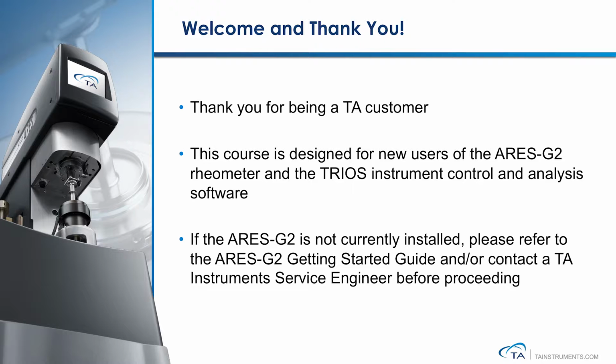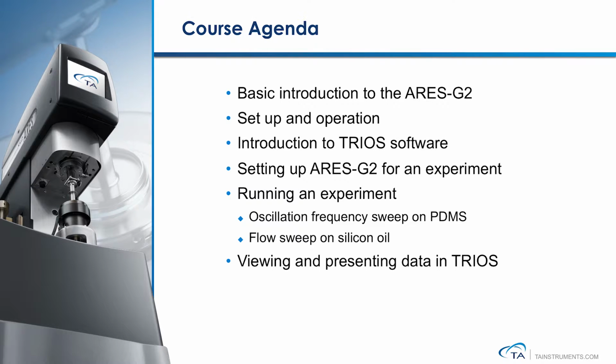Service representative before proceeding. This course will cover the following topics: basic introduction to the ARES-G2 instrument, setup and operation of the ARES-G2 instrument hardware, introduction to the TRIOS control software, setting up the ARES-G2 for an experiment and running an experiment. We will show two different experiments using two different materials and temperature control units.